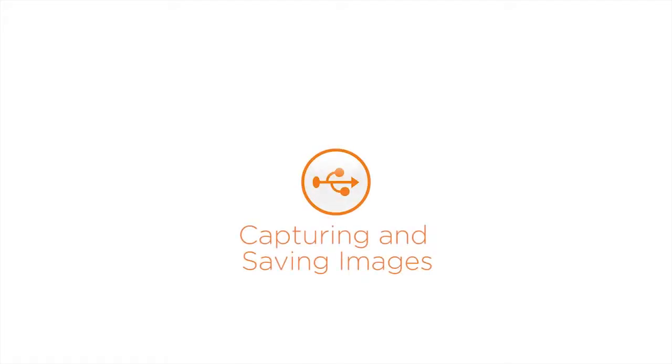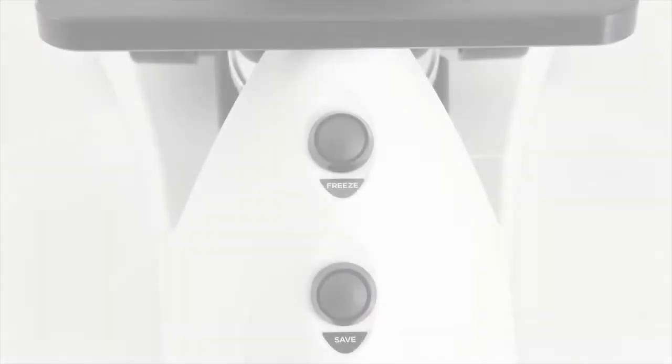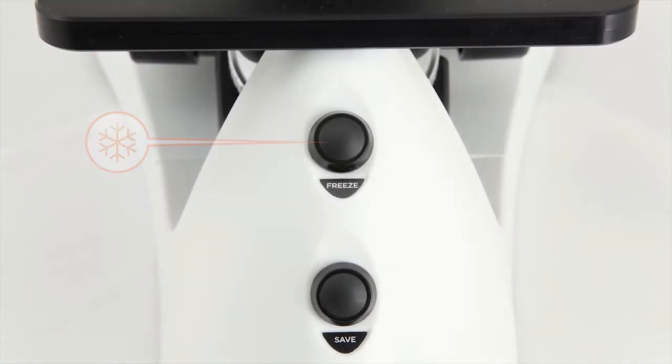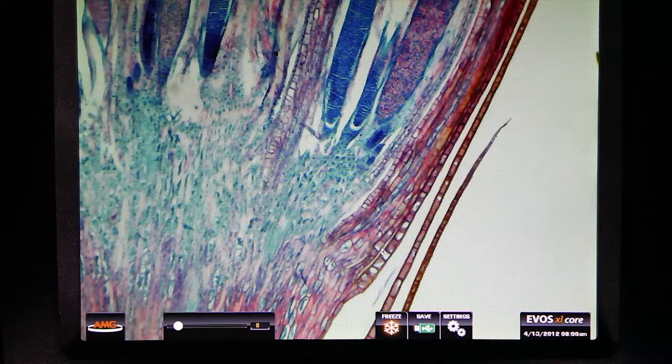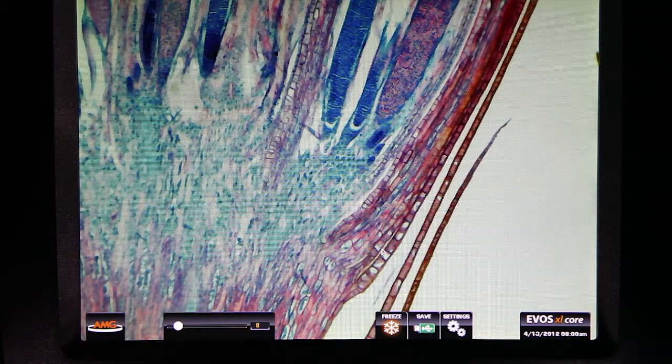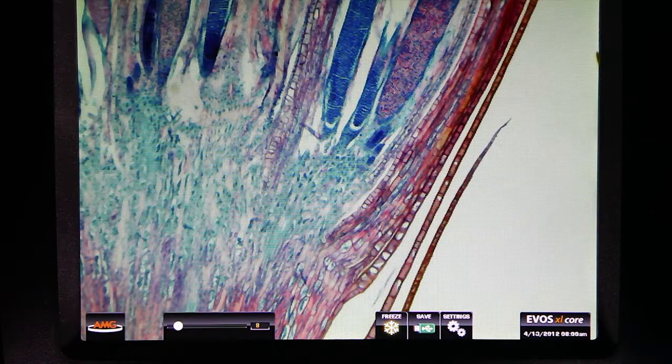To capture an image on screen, you can use the freeze button on the front of the scope or by clicking the on-screen freeze button using your wireless mouse.